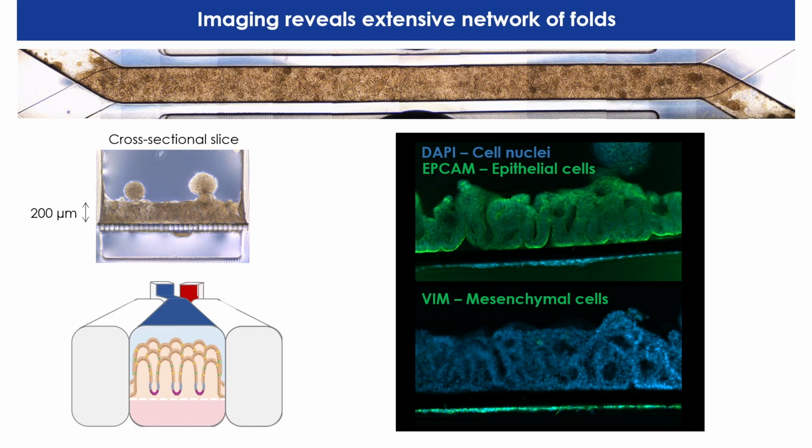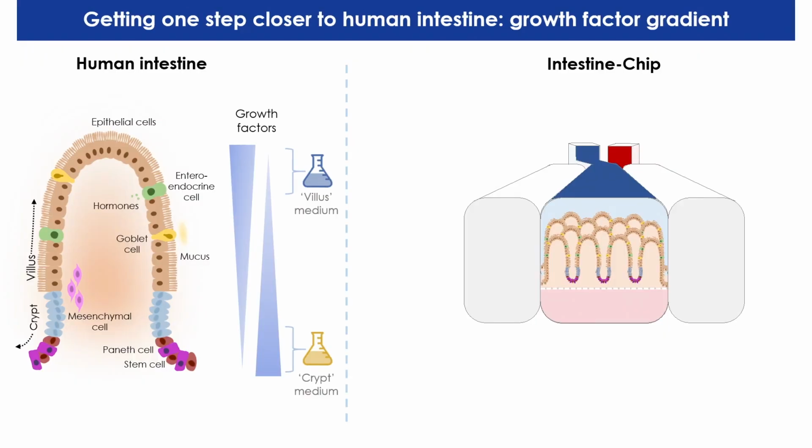Or there might be some kind of epithelial to mesenchymal transition ongoing in the chip. But regardless of their origin, it's very striking that consistently in every experiment these cells are present and find their way through the pores of the membrane to the bottom channel.